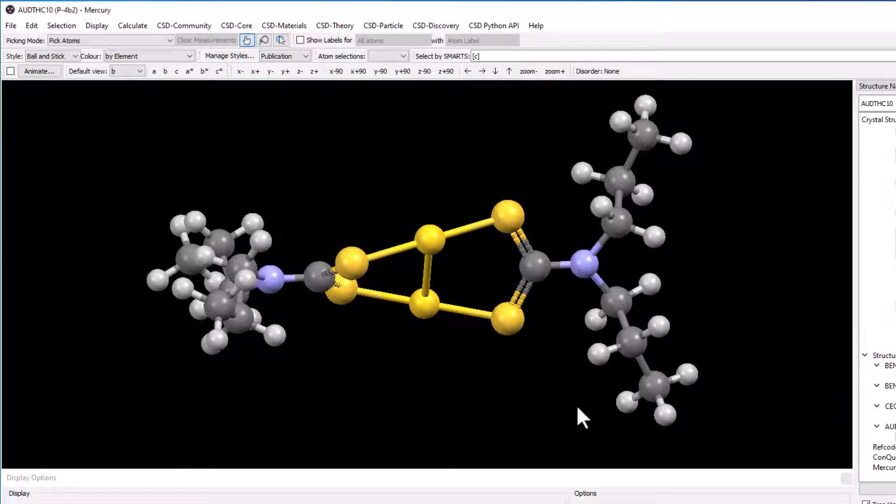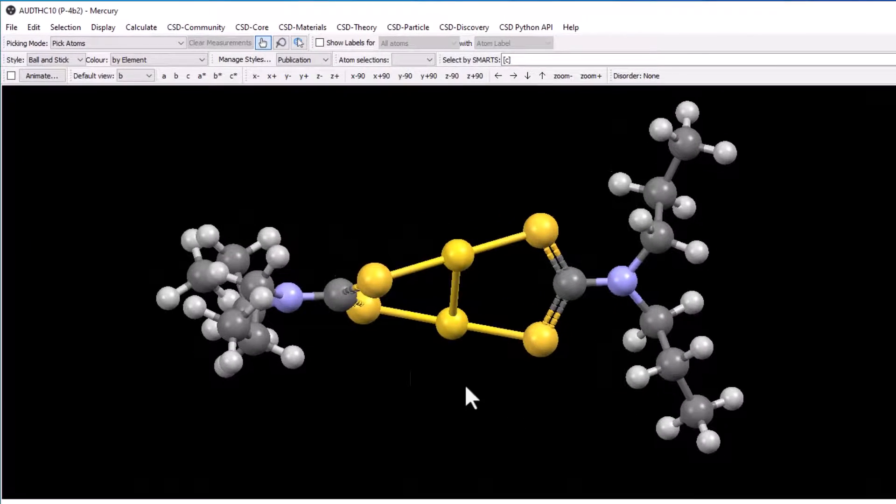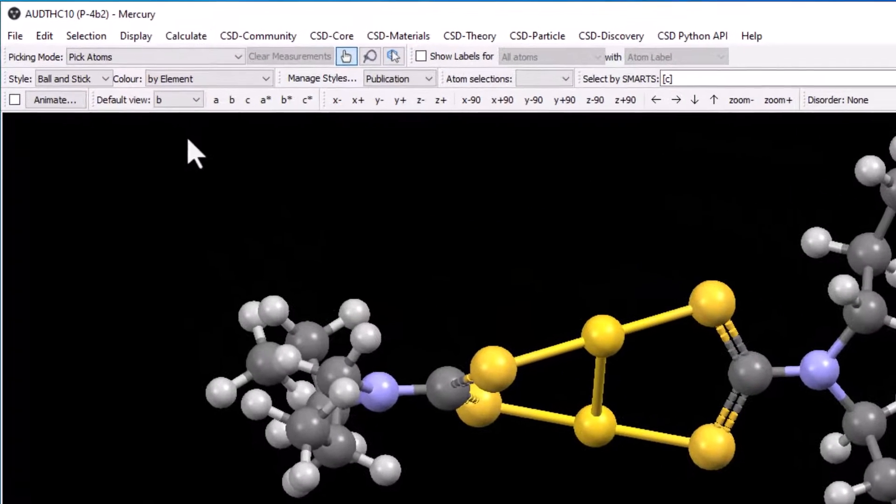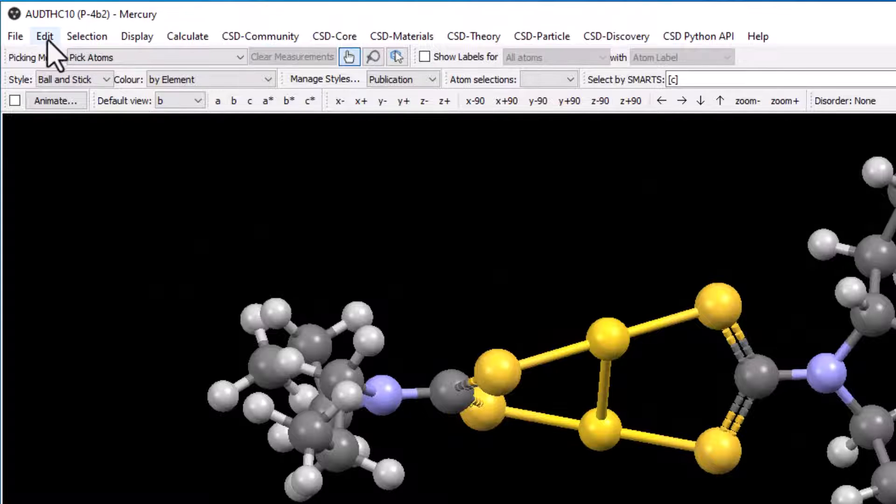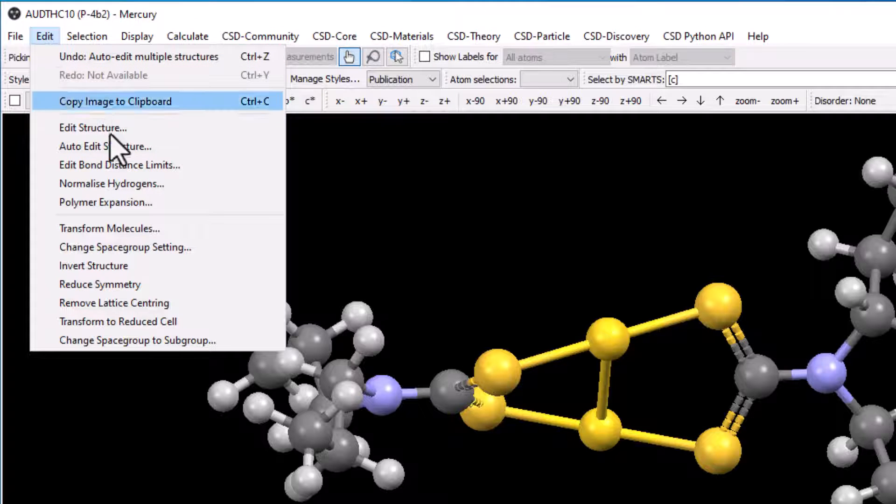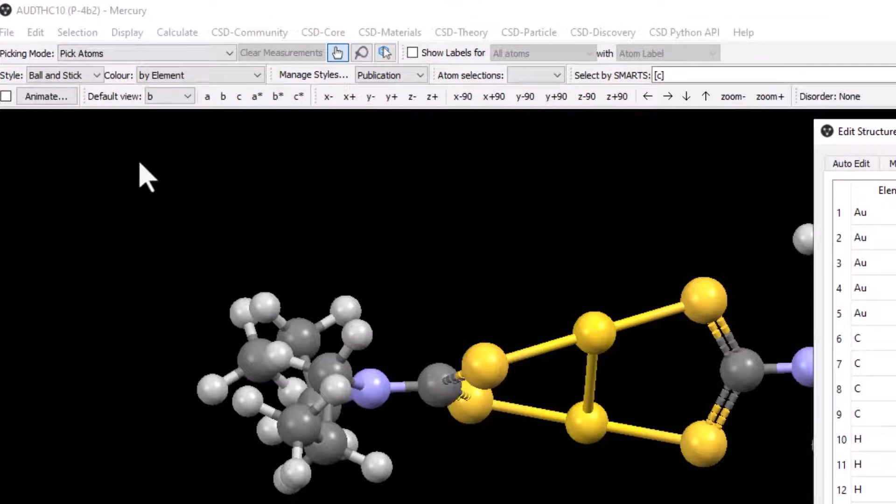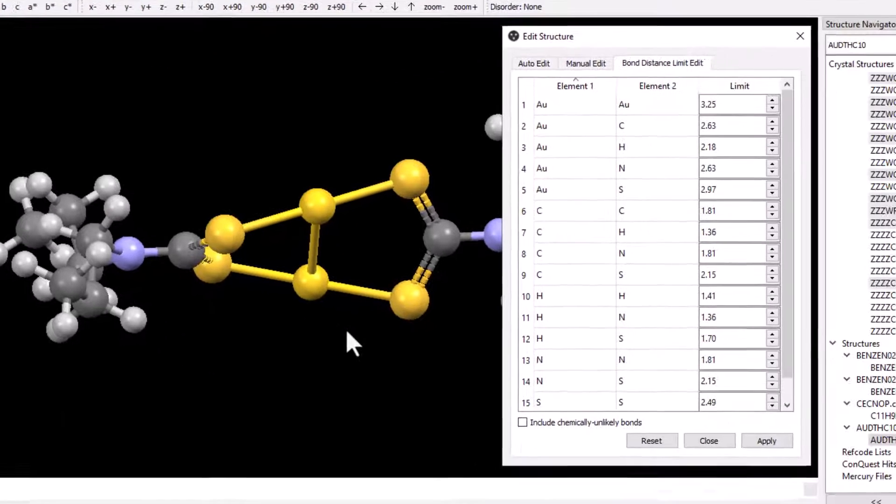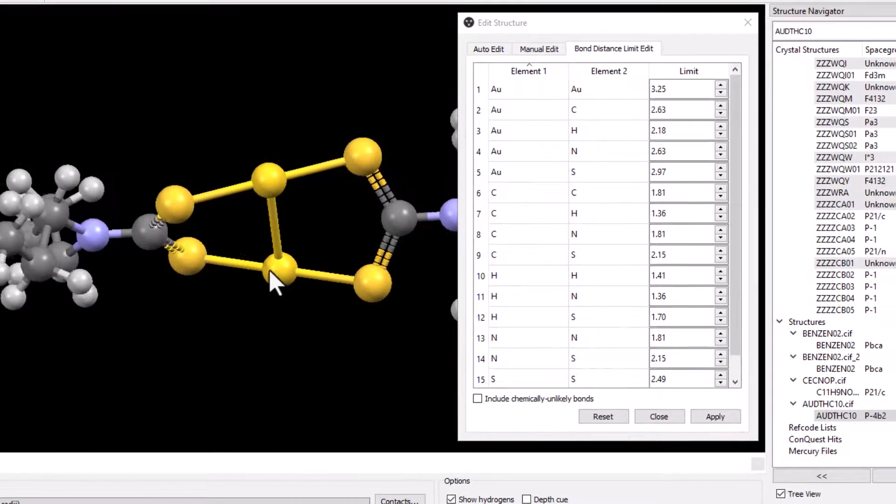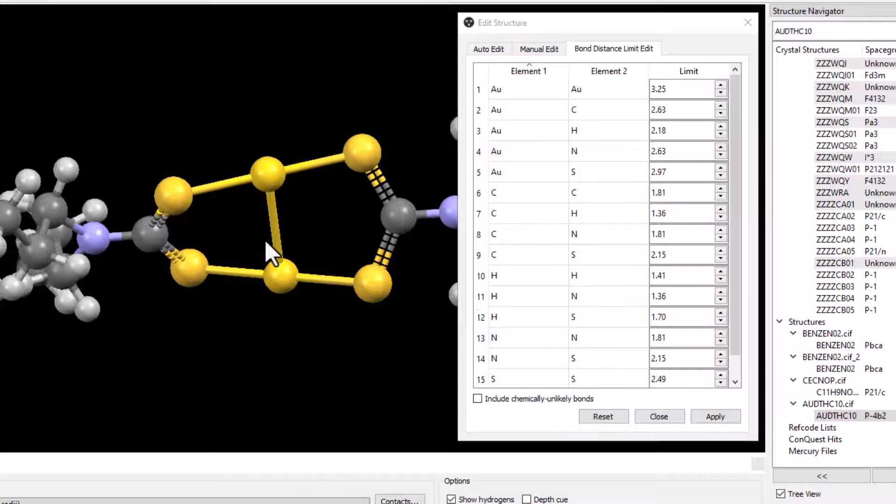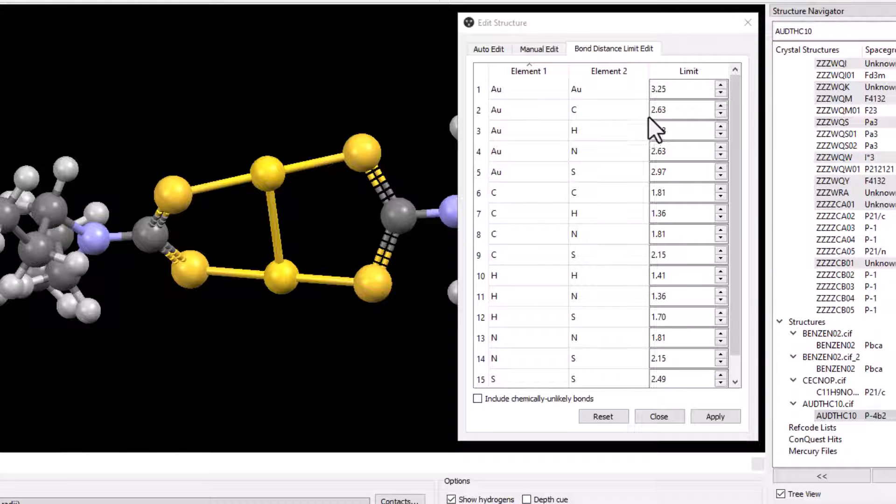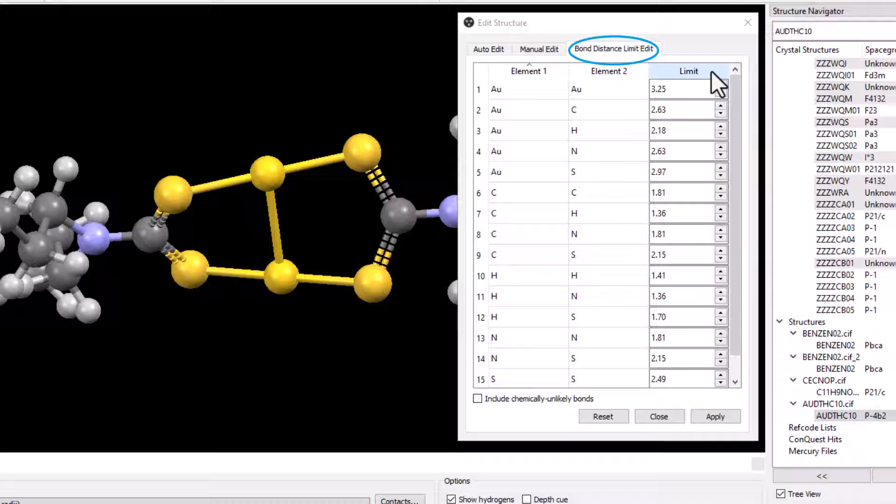To edit the bond distance limits, go to the edit menu and select edit bond distance limits. The edit structure window will appear again. The bond distance limits can be changed under the bond distance limit edit tab.